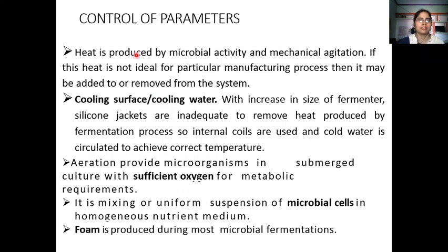So in the bioreactors, what control parameters are required? We have already discussed, such as the heat that is produced during the process. So the heat controller is present. So what is the heat controller? It's a jacket. Yeah, so a cooling jacket is present in which we pass the water that is used for controlling the temperature. Agitation, proper oxygen.